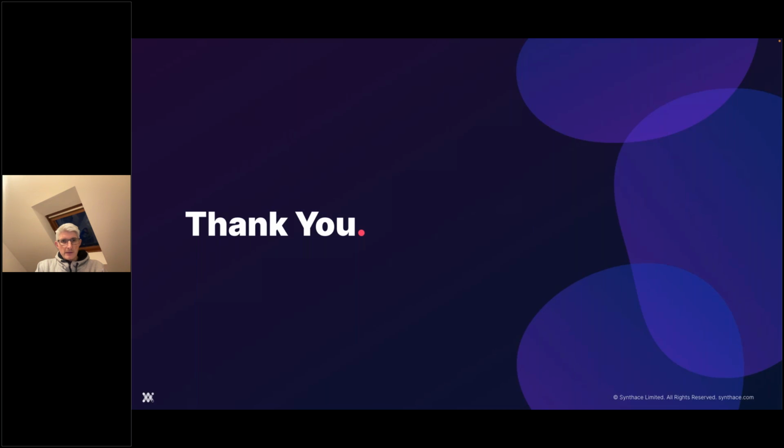Then we've got another question here. Okay, so it's a very similar kind of question. What automation would you recommend for starting out doing automated DOEs? We don't have any automation yet. Okay, you're starting with a blank slate. It depends very much on the biological use case that you have in mind. Like I say, I can't really go into a full survey of all of the different automation solutions that are out there in the space of answering this question. But essentially, you need to look into the strengths and weaknesses of the different bits of automation and choose one which is most suited to your particular applications.